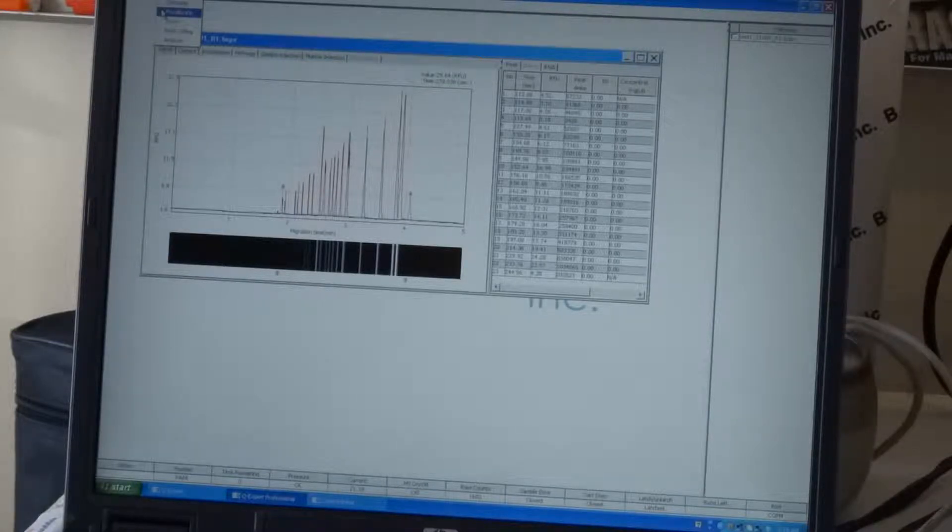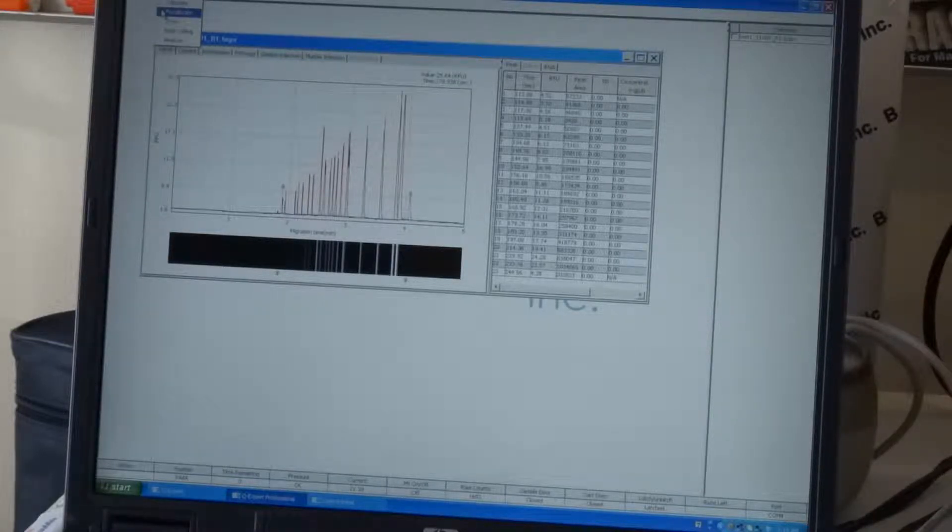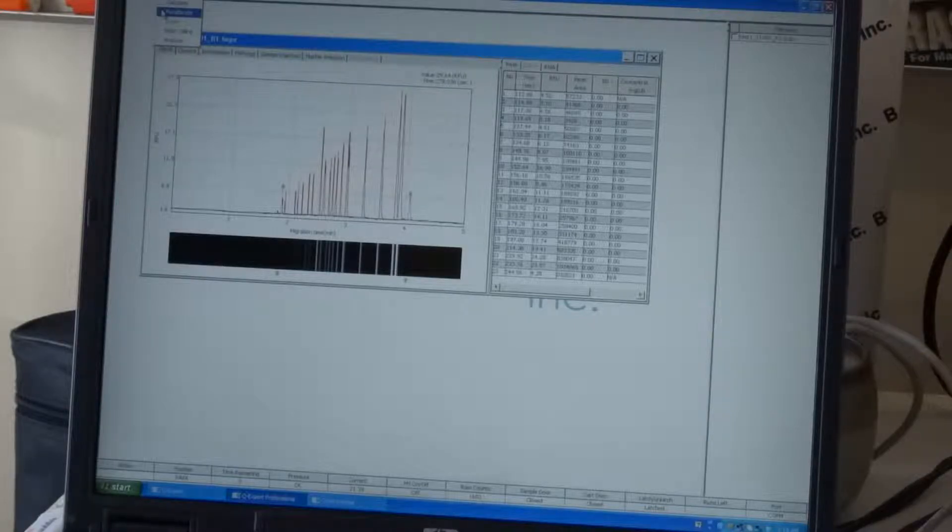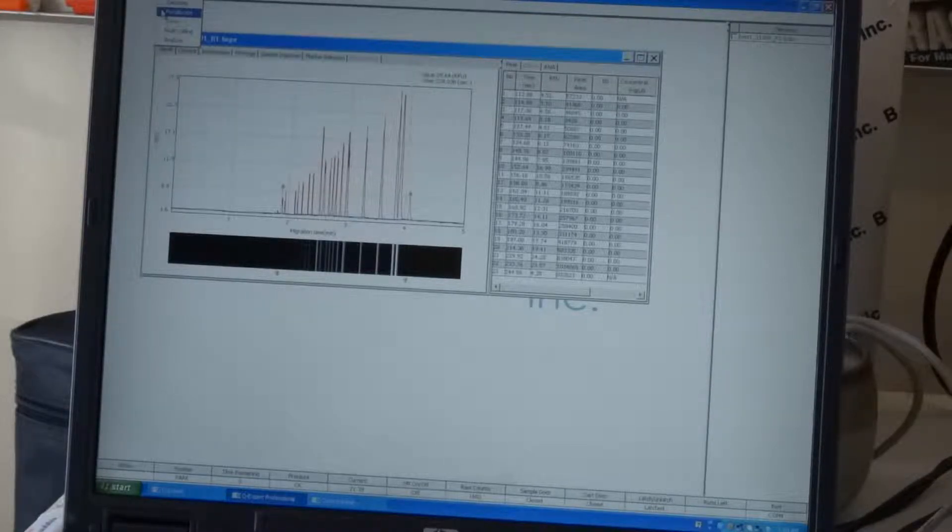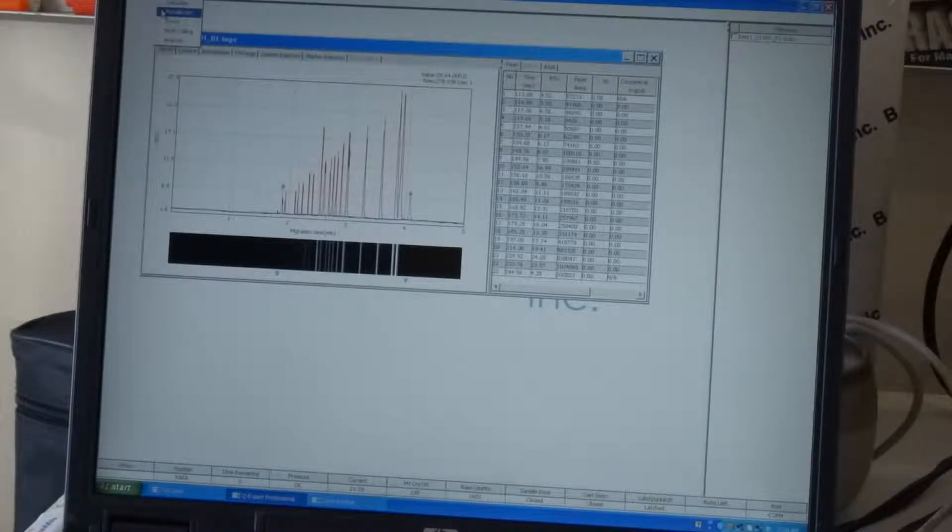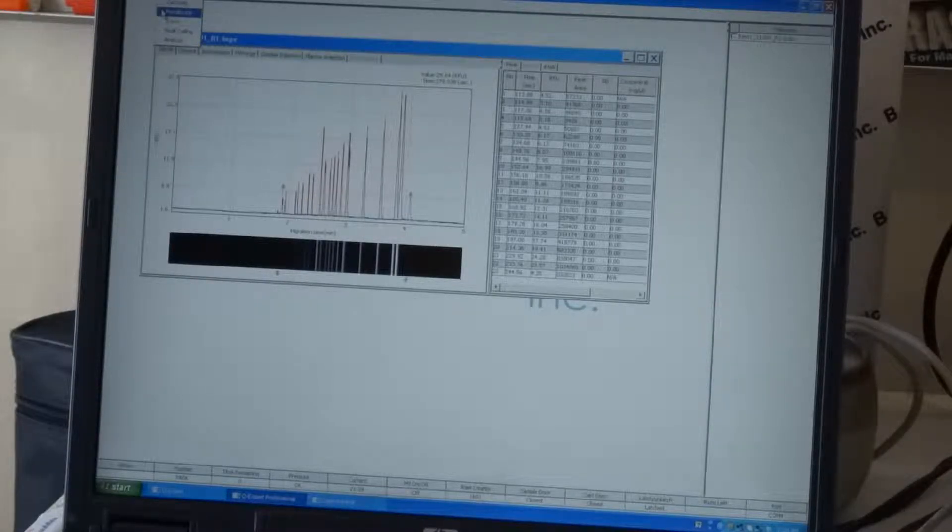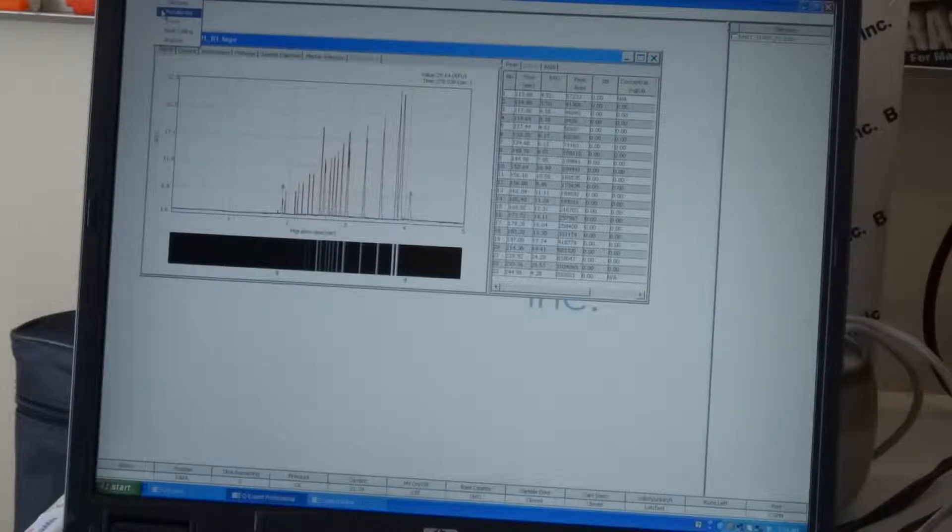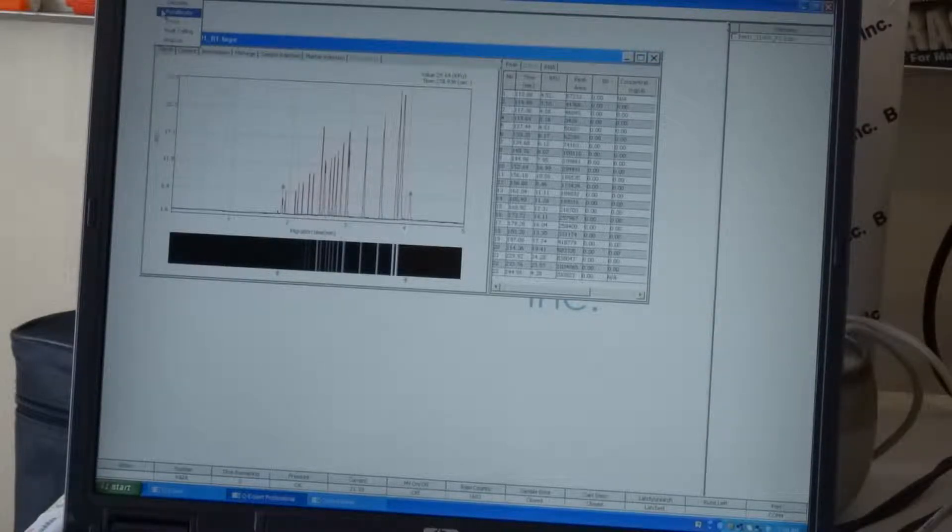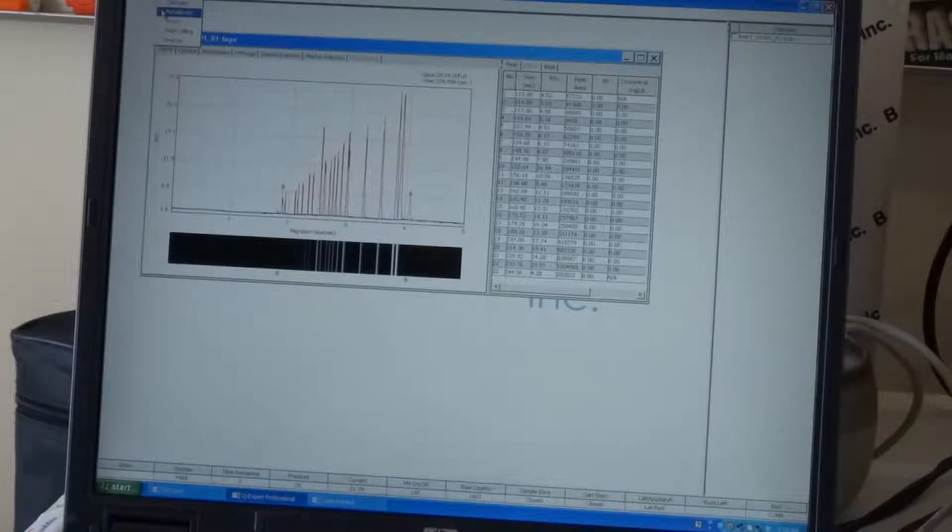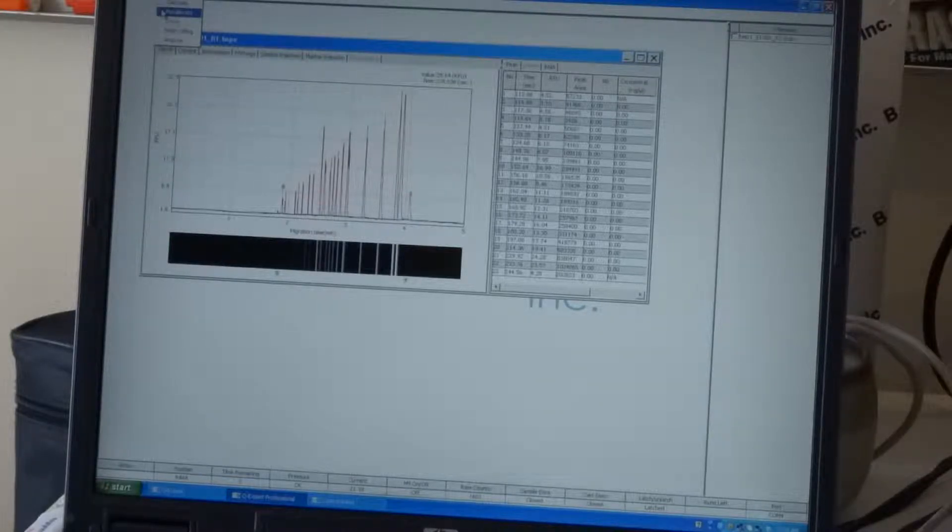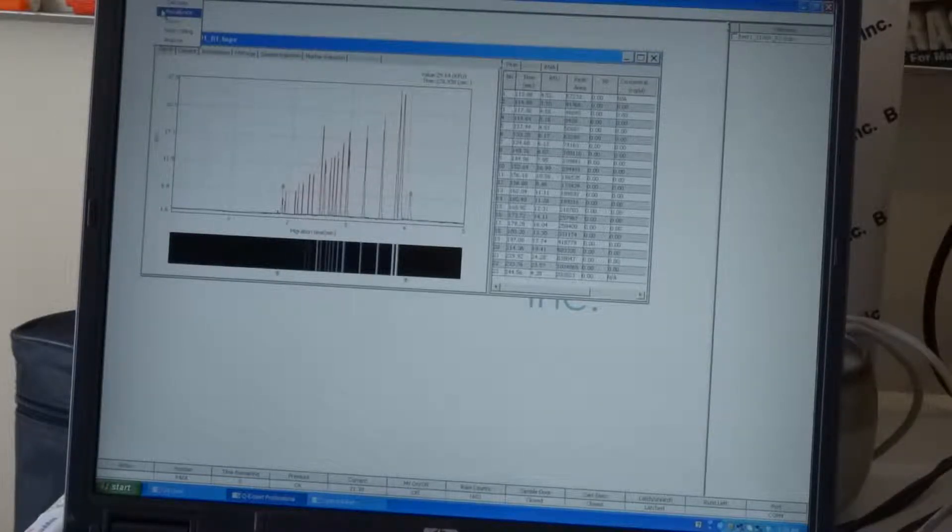So, recalibration of the cartridge basically picks up the solution from the alignment marker, which is the 20 and the 1000 base pair lower and upper markers. It will calibrate and the software will show the two peaks individually run.